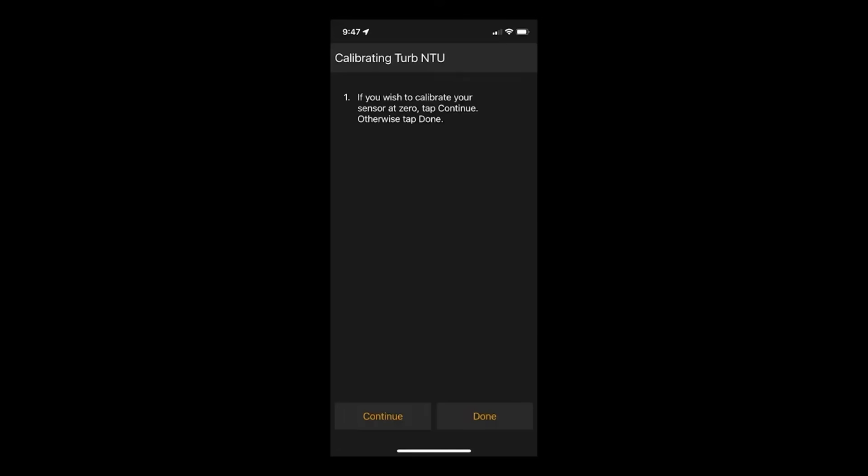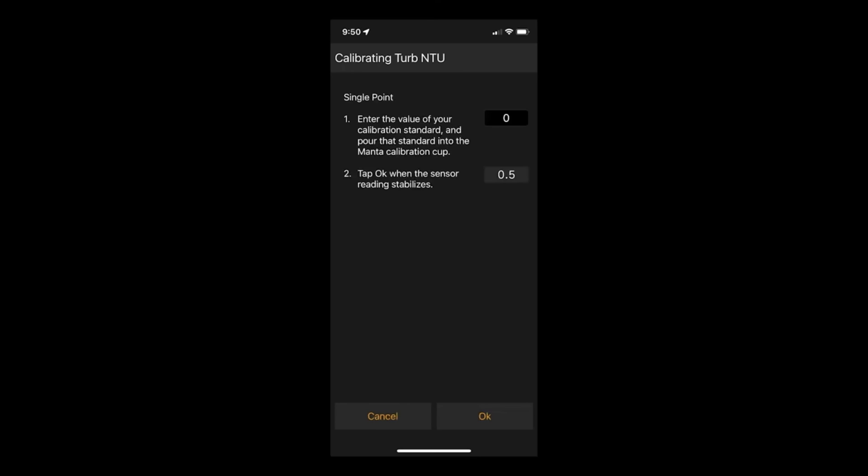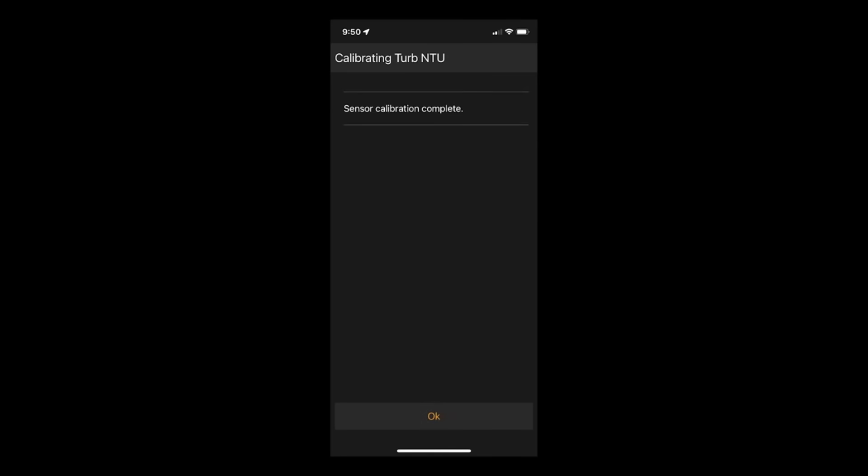The next screen will ask you to calibrate your second point. Enter the value of your calibration standard, pour that standard into the Manta calibration cup, wait for the reading to stabilize, and tap OK. At this point you will see your sensor response factor displayed on the screen. Tap OK to return to the home screen.